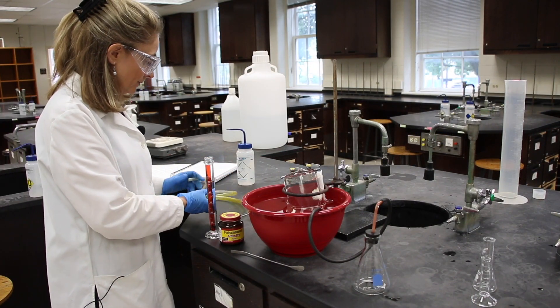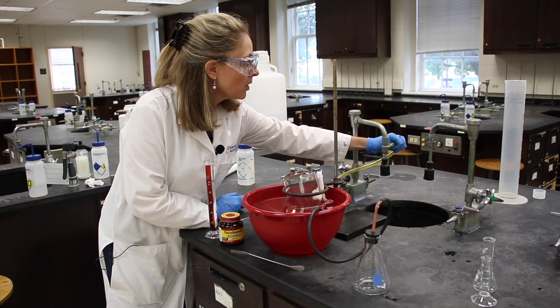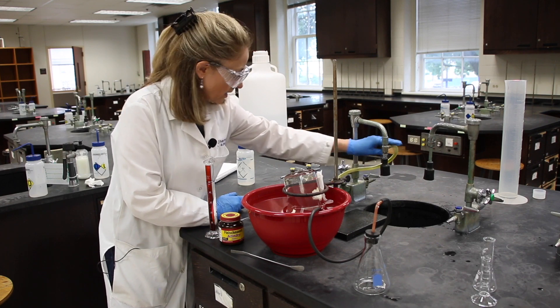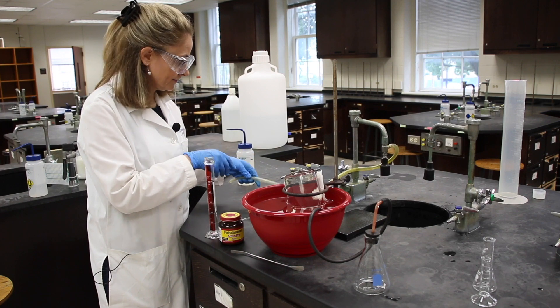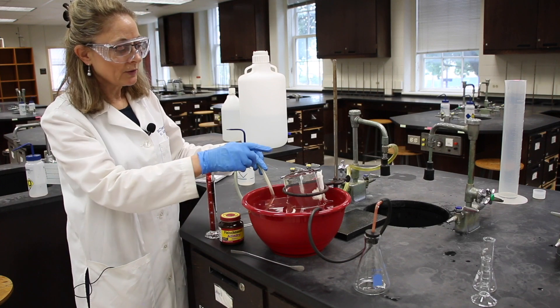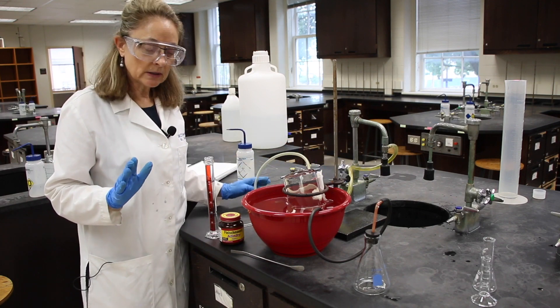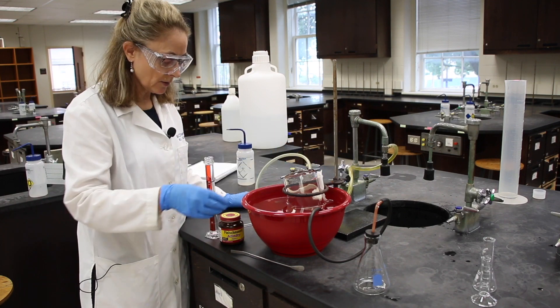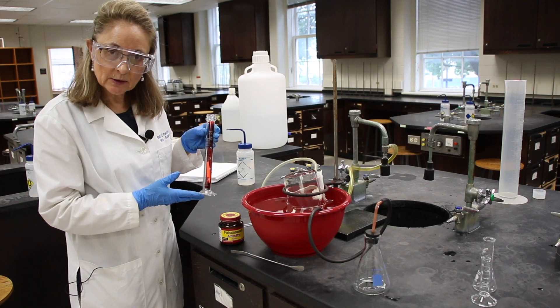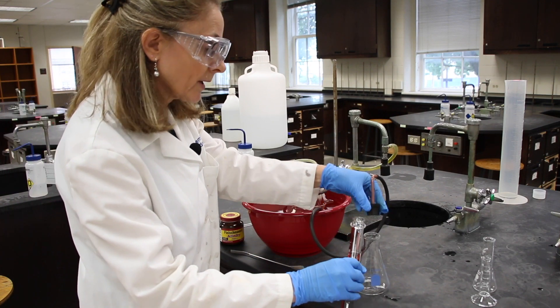In step two, we'll connect our aspirator from the side arm of our water spout, and we'll put the free end in our bowl. Once our reaction goes, we are going to be turning on the aspirator by turning the water on just a little bit, just so that we don't overflow our bowl. In step three, it says to obtain 50.0 mL of DI water, which I've done, and add to the Erlenmeyer flask.